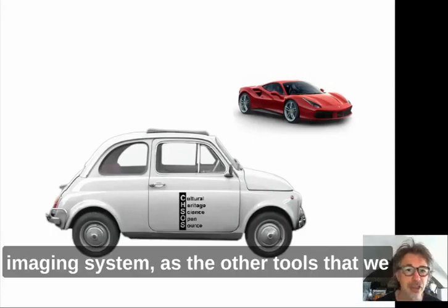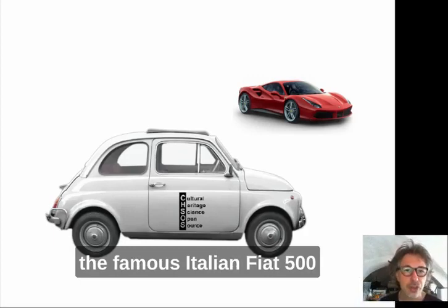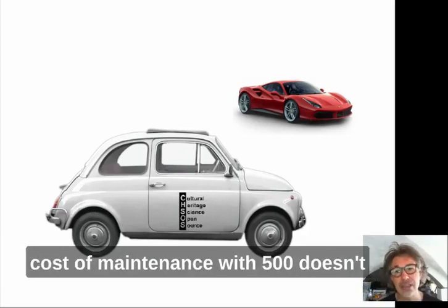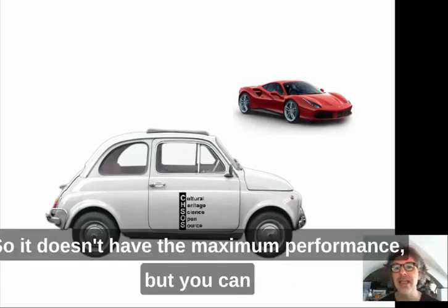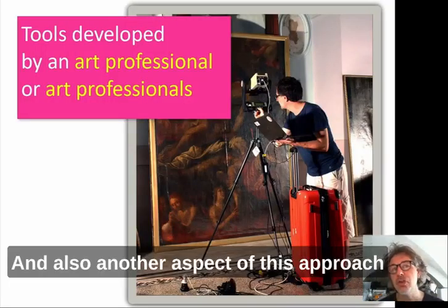The approach of the Antonello multispectral imaging system is like the difference between a Ferrari and the famous Italian Fiat Cinquecento. The Ferrari is the top of the range — very nice, very capable, but high cost and high maintenance. The Cinquecento doesn't have the Ferrari's performance, but you can still go places using that tool. It doesn't deliver maximum performance, but you can use it and get where you need to go.